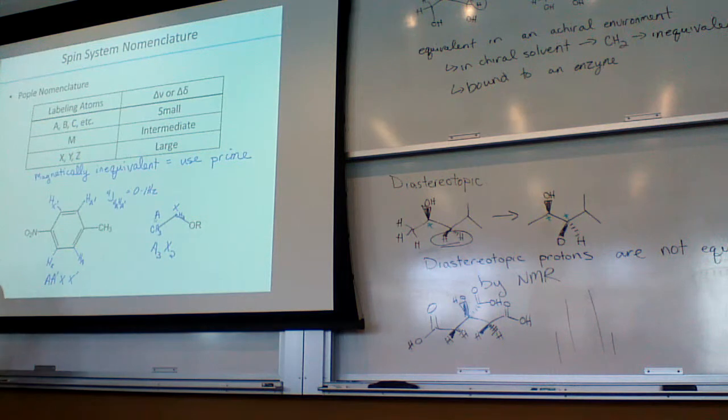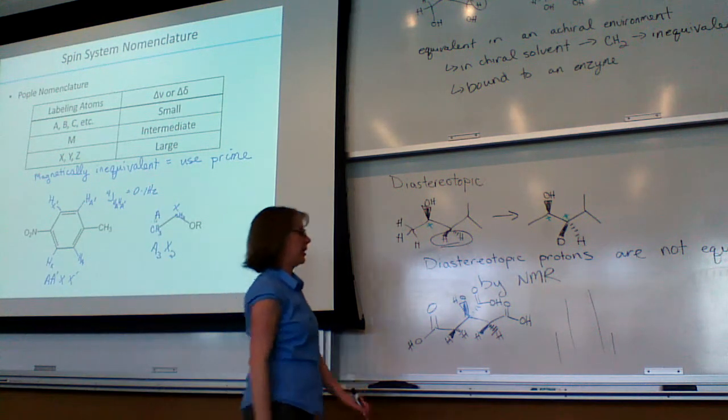That would actually be an example of diastereotopic protons in an achiral molecule.